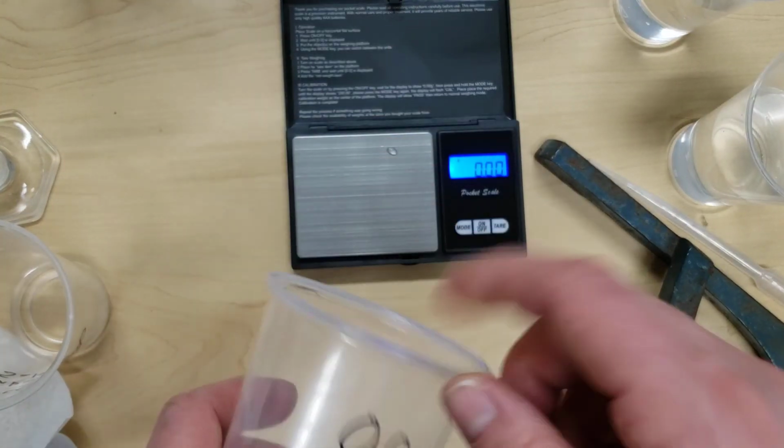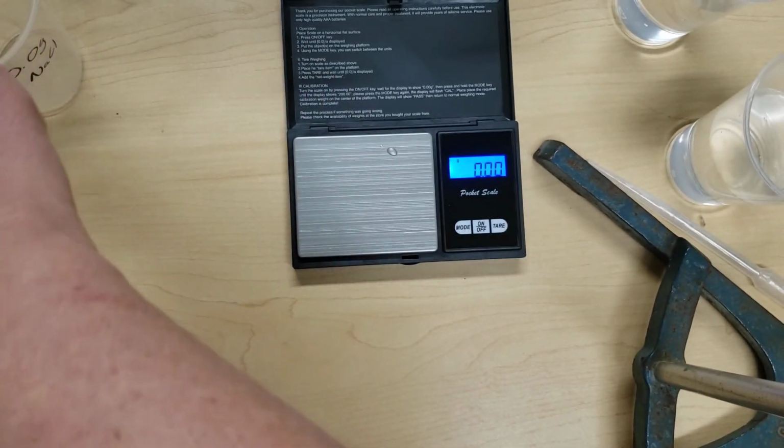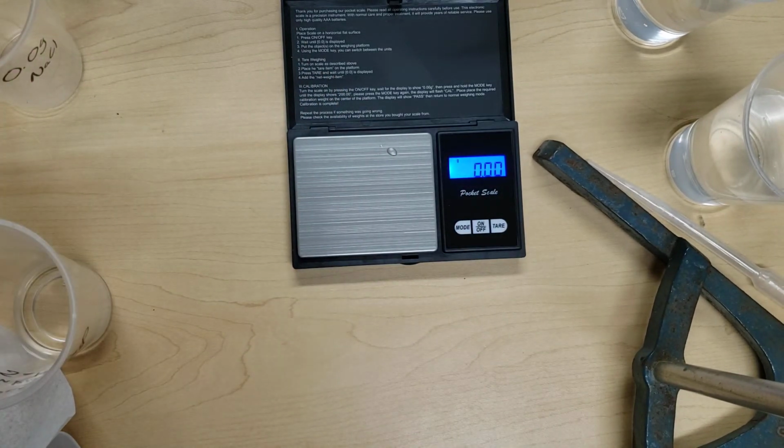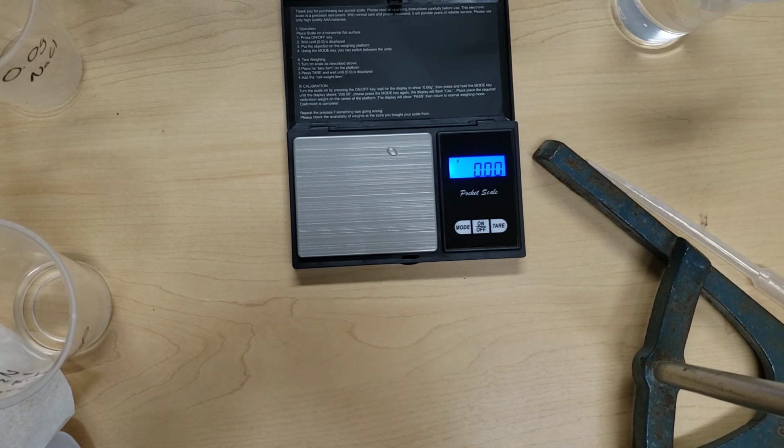So the very first one, where we have no sodium chloride, we are not going to have to weigh out any salt, but we do want to measure out about 10 milliliters of water.